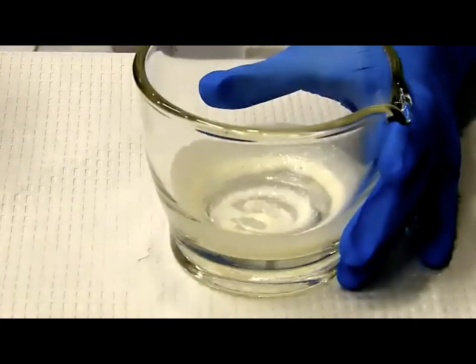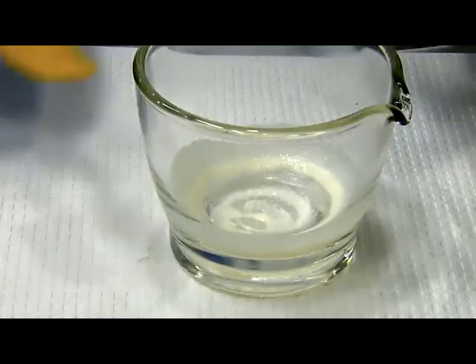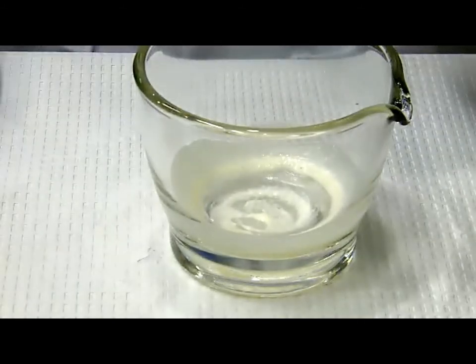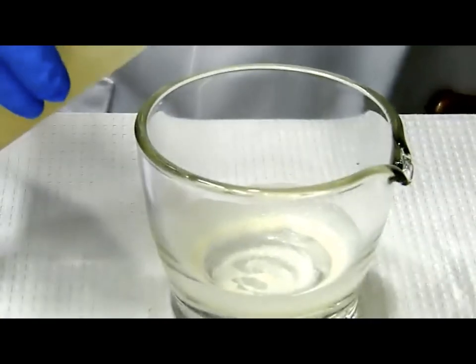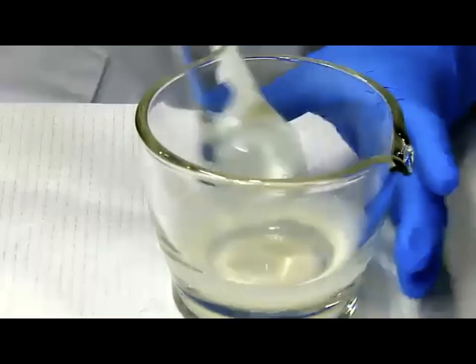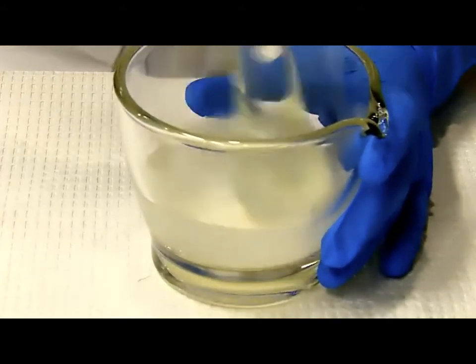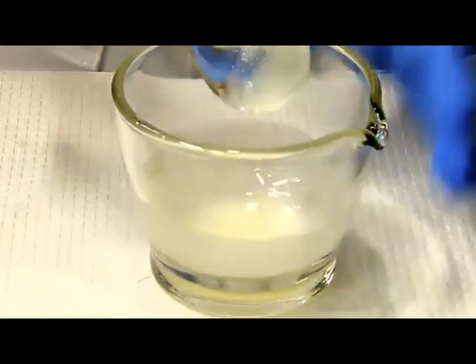Usually by the first addition, I try not to use my rubber spatula yet because I don't want to have too much drug stuck on the rubber spatula. All right, so here comes the second addition. Remember, it is geometric dilution. So I'm adding about the same amount compared to what I have inside the mortar already. And here comes my second addition. Let's triturate and mix so my final product will become uniform. Okay, that looks so much better.